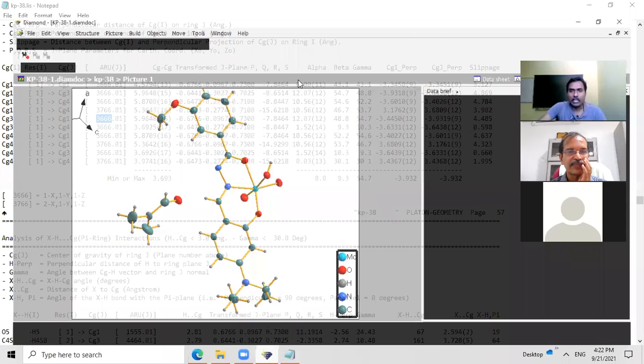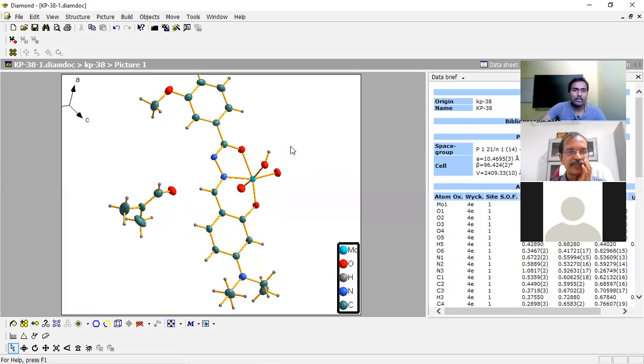So now can you see this Diamond software, sir? Now. Yes, sir. Okay.